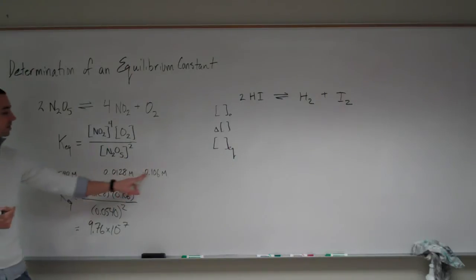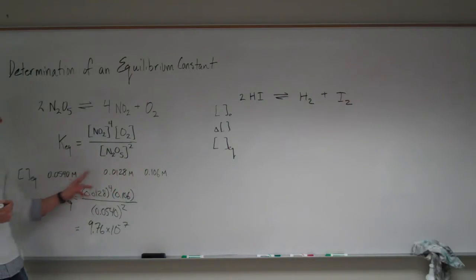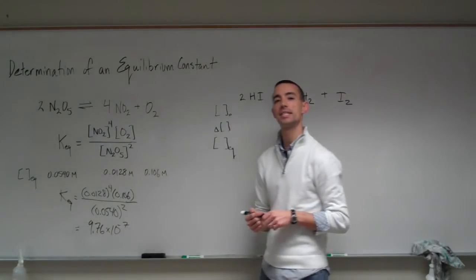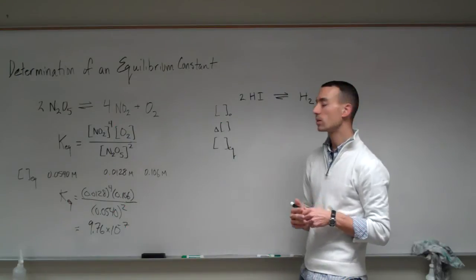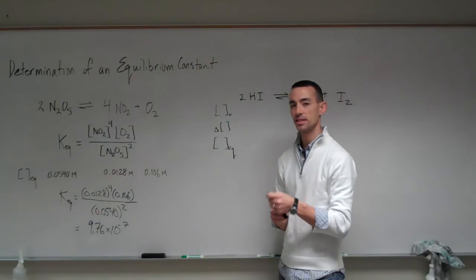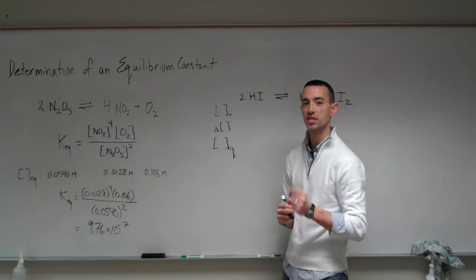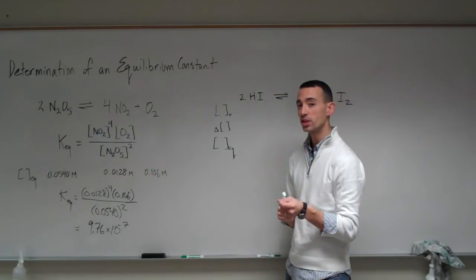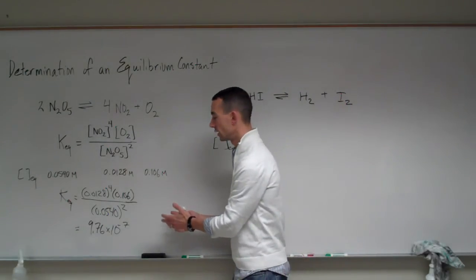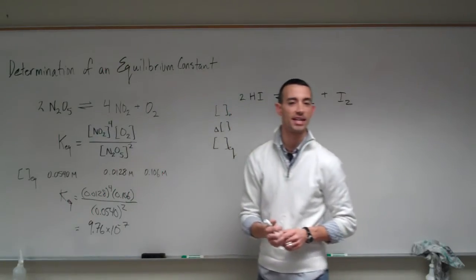Although these 3 numbers might be different, the 3 numbers we would get would combine in this formula to still give us 9.76 times 10 to the minus 7. And that will be one of the ideas that we're putting to the test in our lab today. You'll measure your equilibrium constant 3 times, each beginning with a different set of initial conditions, very slightly different. And hopefully you'll still get the same combined ratio, proving the name equilibrium constant in that experiment.